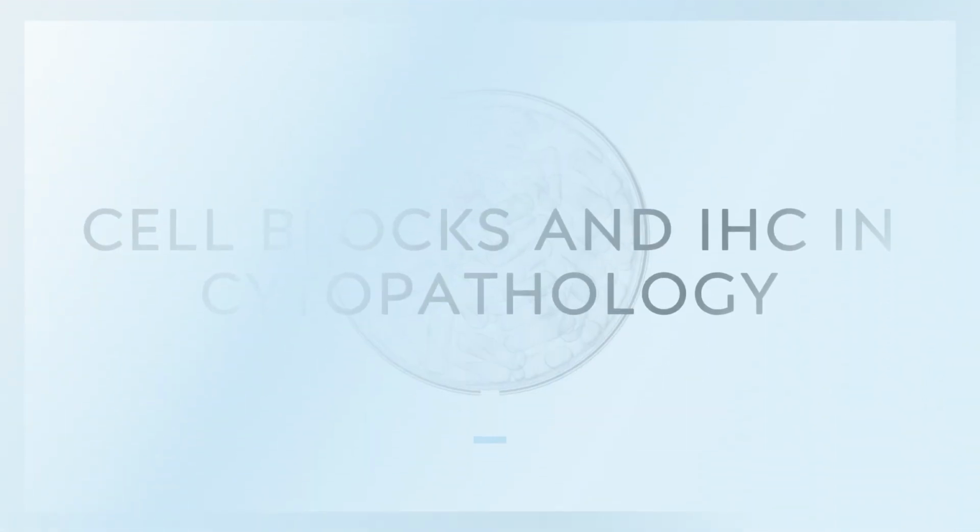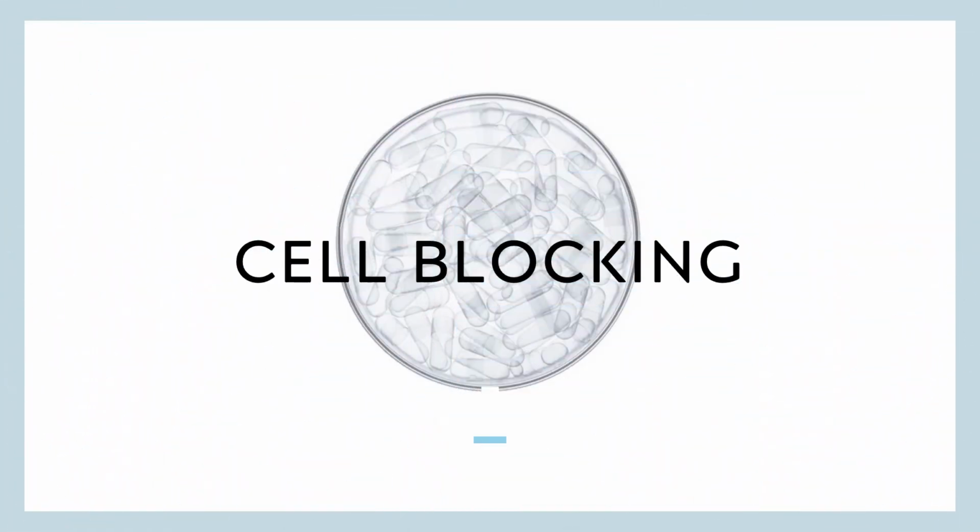For today's topic, we will discuss cell blocks. So cell block, this is to process body fluids as cell block for microscopic examinations. Materials from fluids of the body may be examined either by smear techniques or by preparation of tissue blocks to maximize detection of the neoplastic, inflammatory, and/or infectious lesions in the body fluids and other tissue juices. So this is a method wherein fluids undergo preparation before actual embedding in paraffin.